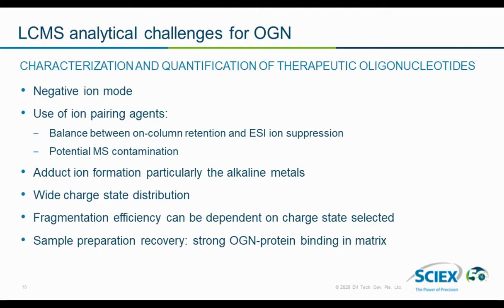Finally, sample preparation recovery. You've got to be careful here. Strong oligonucleotide-protein binding in the matrix can happen, so you've got to be careful of that as well when you're trying to release the oligonucleotides for the analysis.